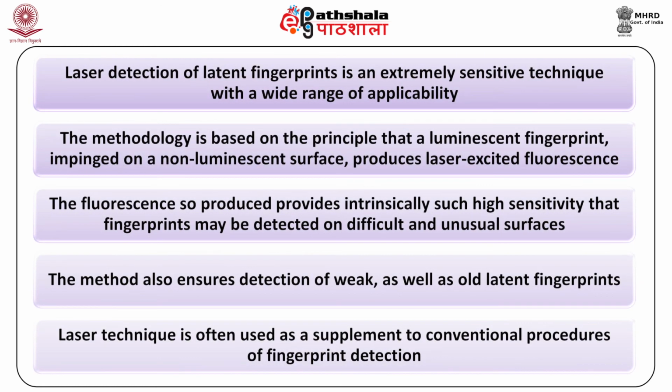Laser detection of latent fingerprints is an extremely sensitive technique with a wide range of applicability. The methodology is based on the principle that a luminescent fingerprint impinged on a nonluminescent surface produces laser excited fluorescence.